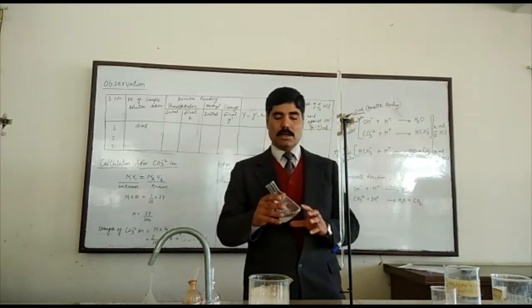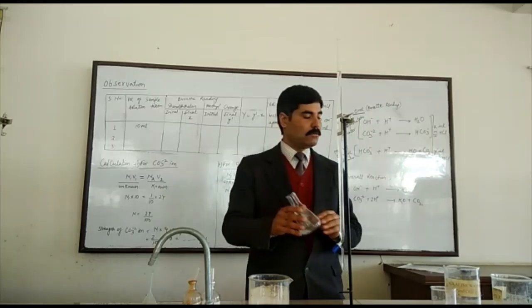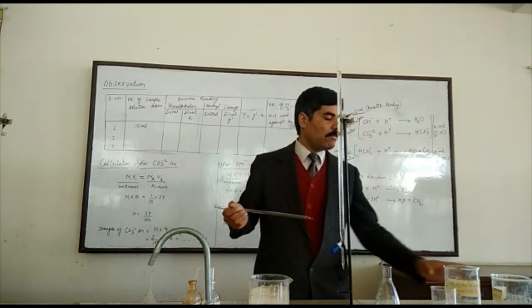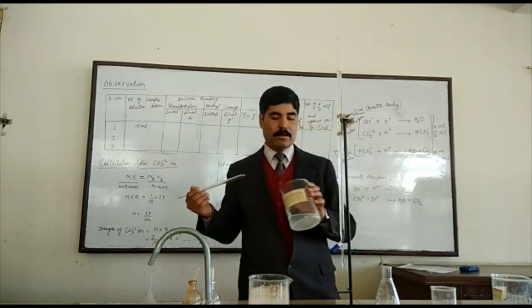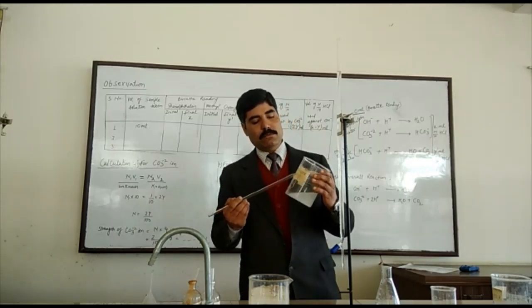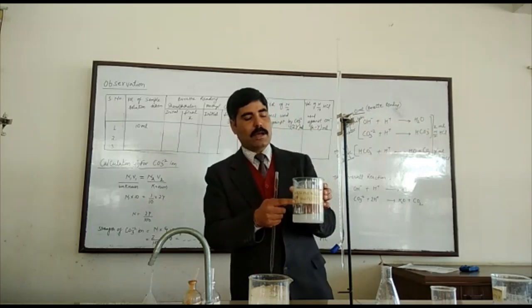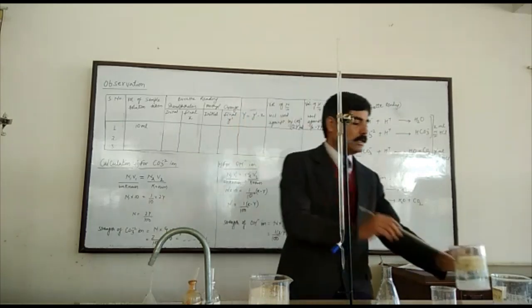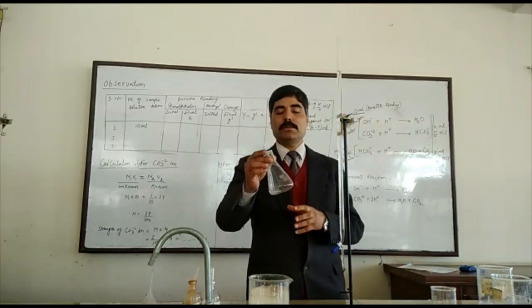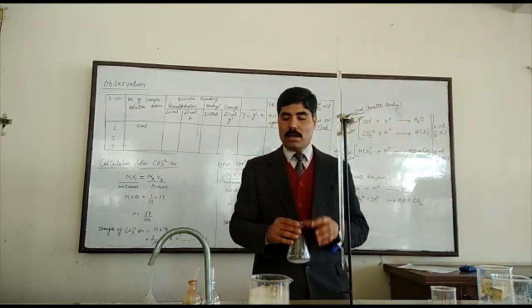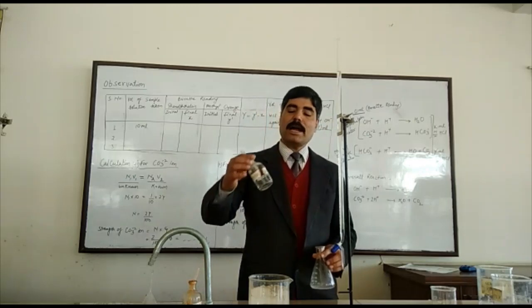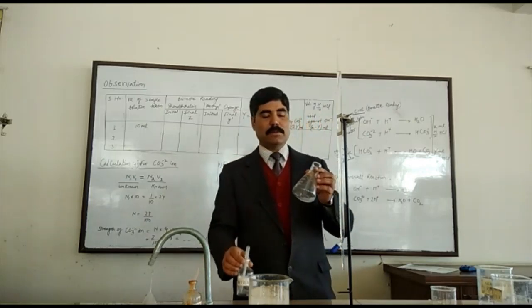Now we have to take the unknown sample solution into a conical flask with the help of a pipette. This is the pipette and we take 10 ml of the given sample solution — that is the alkaline water due to the presence of hydroxyl and carbonate ions — into the conical flask. We already have 10 ml of the unknown sample solution in our conical flask. Now before starting titration we have to add the indicator.